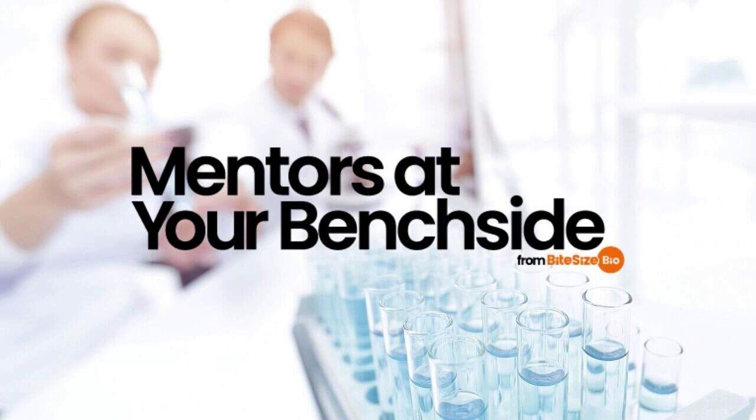Number 6, antibiotic issues. One important consideration when diagnosing poor plasmid yields is the antibiotic. The bacteria are going to break down the antibiotic while they are growing in the culture. If not enough antibiotic is added, or if the stock is old and not at the correct strength, the antibiotic selection pressure may not last very long, and you could end up having a culture that was antibiotic-free for most of the culture time.